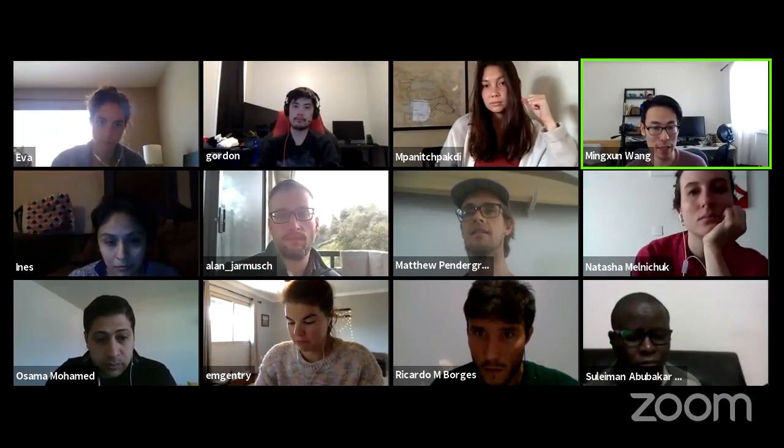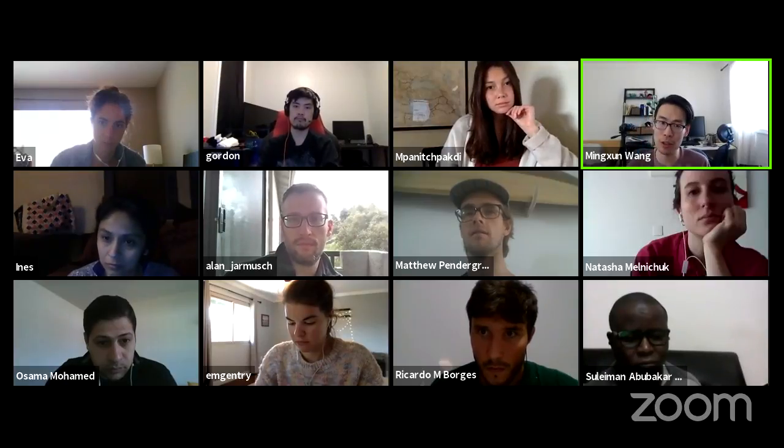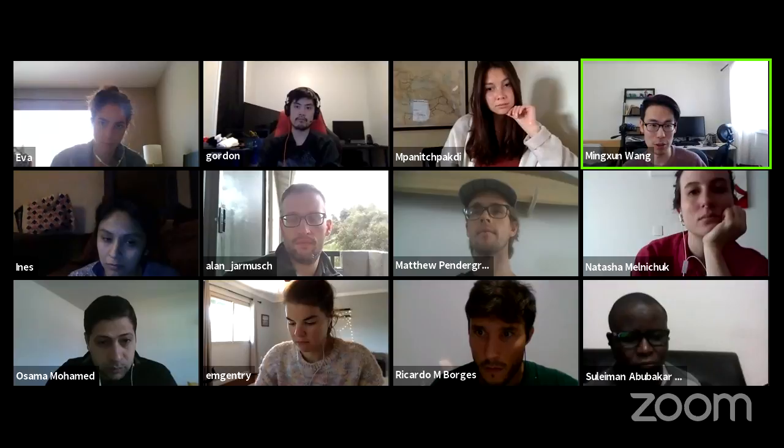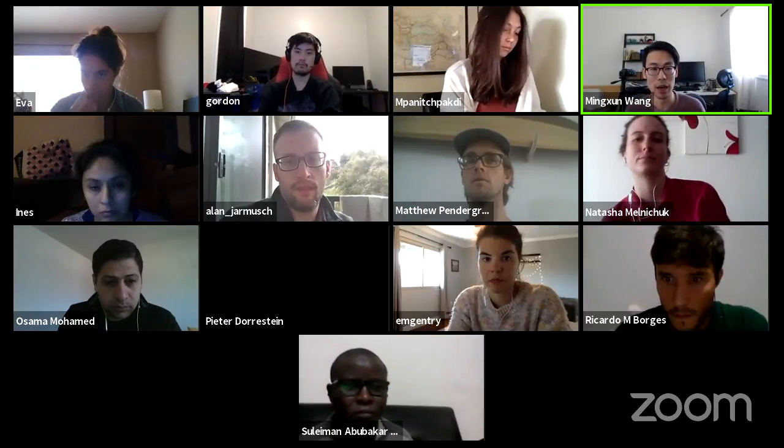We want to organize other small workshops like this. We're thinking about a workshop with a few more lectures mixed in, but also maybe having somebody lead a similar workshop that's very focused, perhaps on molecular networking, perhaps on a separate tool like ReDU, where that's all we talk about. We'll say, oh, and it links out to X, it links out to Y, but we won't spend much time on it. It's going to be kind of a core. We'll try to give you context on how it fits together in the ecosystem, but it'll be focused on one tool.